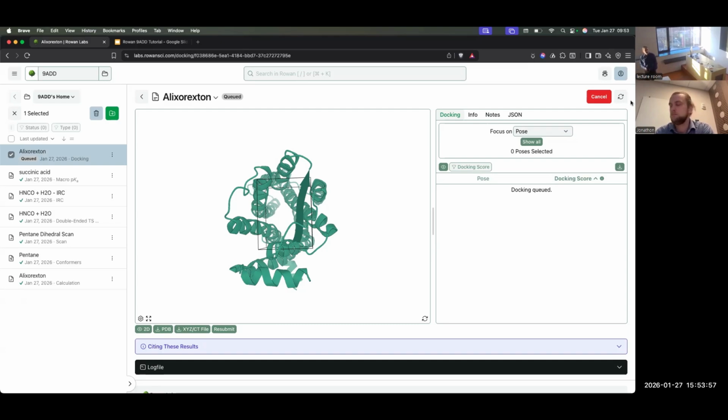So just as an example, it's an automated process, but to what degree, if people really want to, can they customize this? Even just a simple example being your sanitization procedure, or is it kind of on rails for generality? It's both.